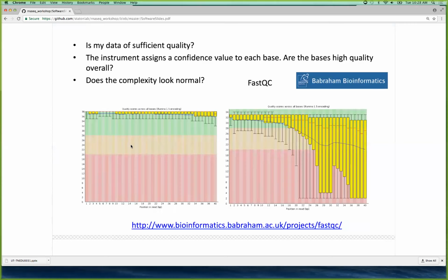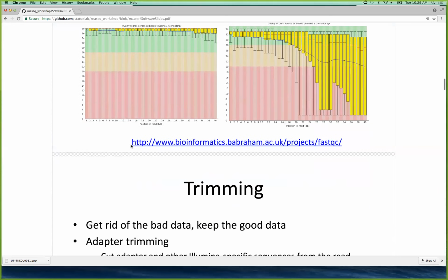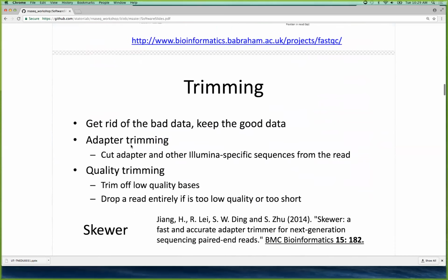When you set a cutoff in green, what's the cutoff? Is it the green cutoff? Yeah, this is the cutoff. And in FastQC, usually there is a fixed cutoff. It is mostly for visualization. But where you're going to set it actually is when you're going to trim.